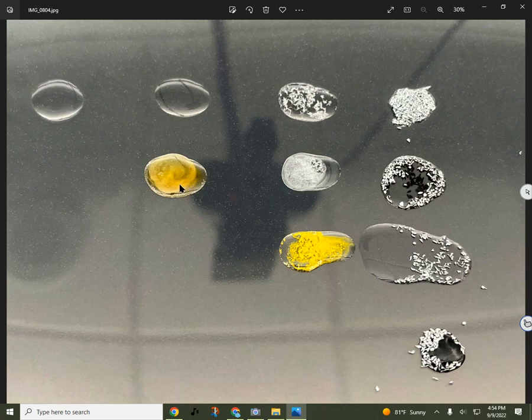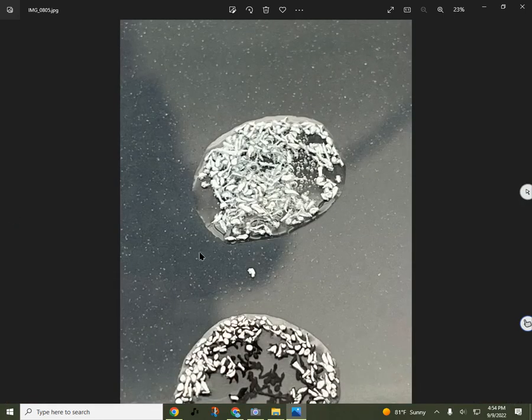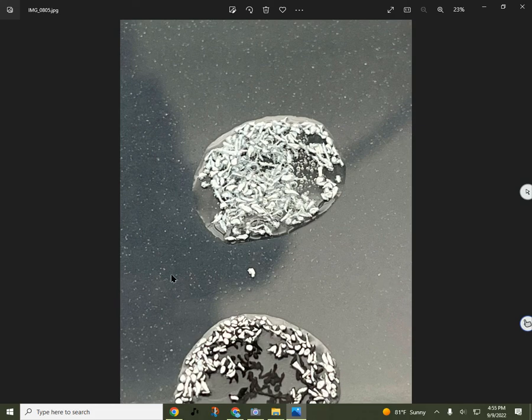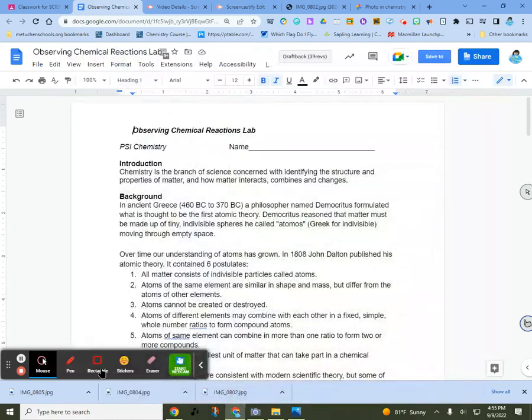You can see here that it wasn't just a color change — it's actually a yellow precipitate that formed making this yellow color. And then I have a close-up of the zinc and hydrochloric acid, and now here you can really see the little bubbles. So those are the chemical reactions that we saw today. That's it — take care, bye bye.